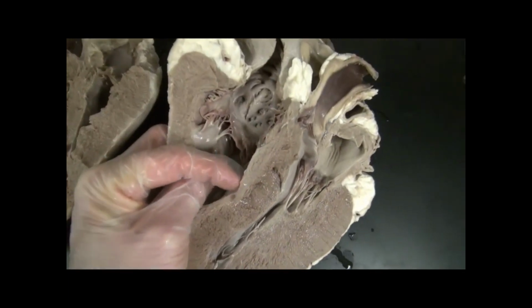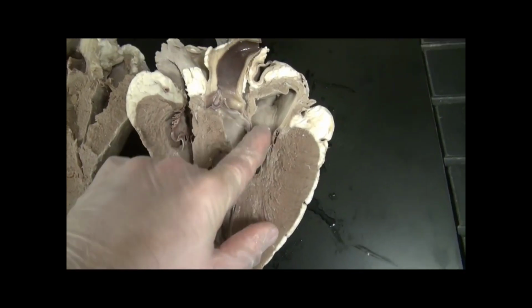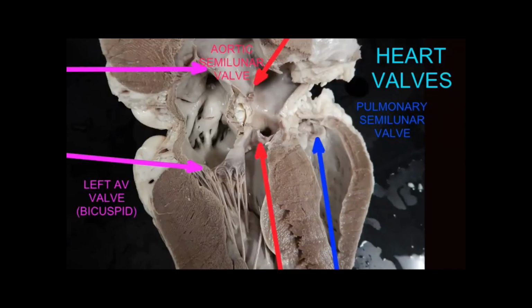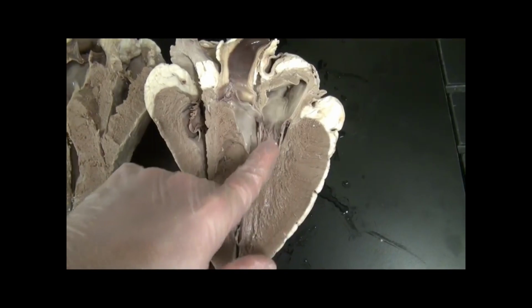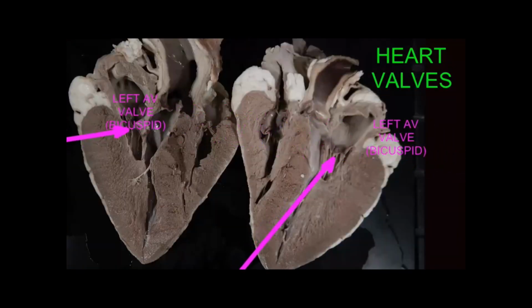Heart valves, like those in this beef heart, exist to prevent blood from going the wrong way. During the cardiac cycle, there are moments where blood would move in the opposite of the desired direction, from the ventricles into the atria, or from the vessels, the aorta and the pulmonary trunk, back into the ventricles. Valves exist to stop this.